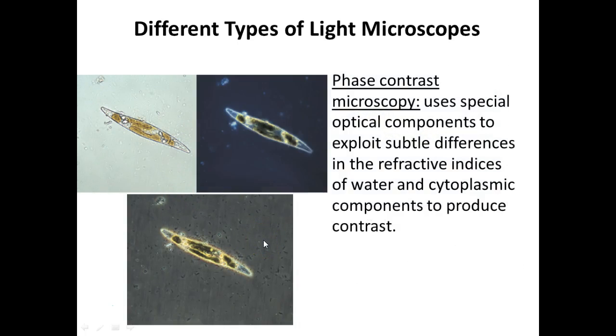I wish we did. That's the next grant I'm going to write. I'd like to get us some special filters that change the phases of the wavelengths of light, which helps give you better contrast. That's why it's called phase contrast. So notice this is bright field, this is dark field, this is phase contrast. You see how much more you see, right?